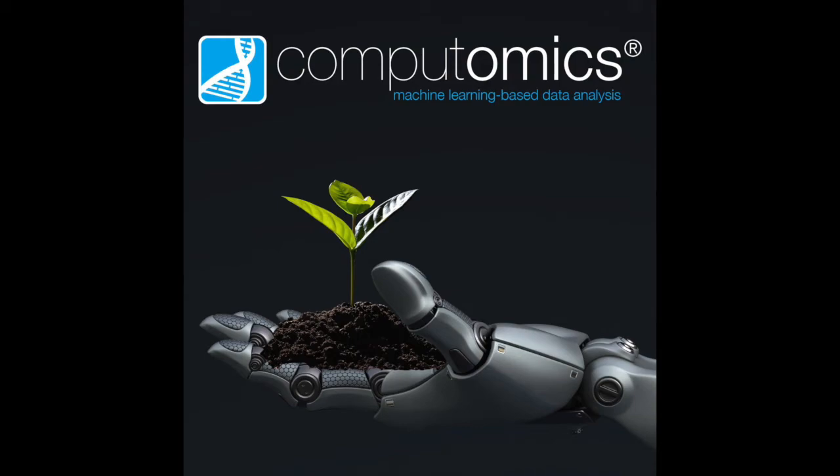And this way, I think, would be really nice, because at the point where the customer interacts with the sequencing results, it's not just big FASTQ files of sequence data, but it's really results, because we've already run our set of standardized analyses, and the customer can already look at results instead of just having to handle raw data for hours or days even. So we think that's also a very good case where Morpheus would be beneficial. Yeah, I think that's really great. It's really great that you hit on that.